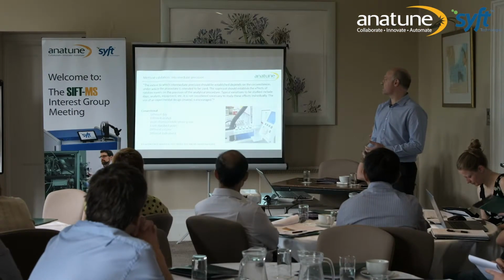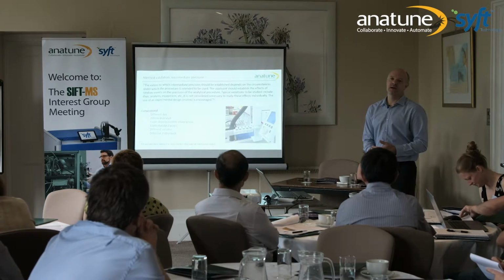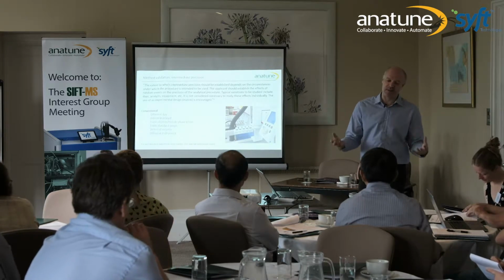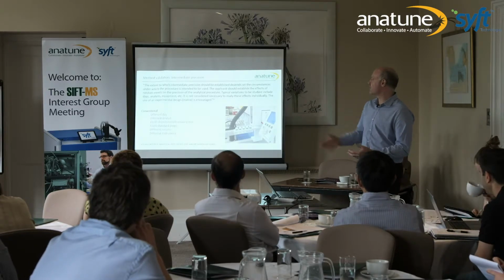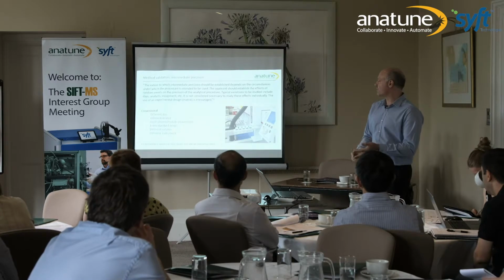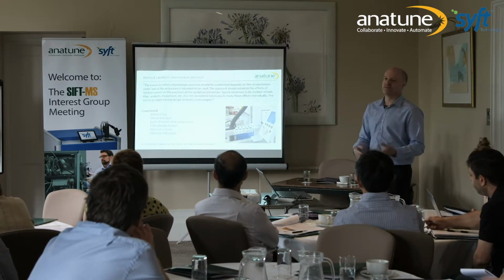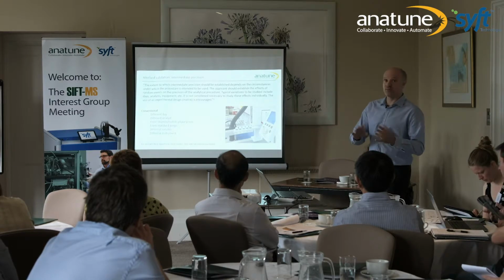Intermediate precision is essentially asking you to look at the system with somebody else using it, doing something else on a different day, hopefully with a different instrument. Conventionally you'll look at a different day, use a different analyst to make the samples, and use fresh mobile phases if it was LC, which we don't do here. Fresh preps are the standard, and a different column, but we don't have a column.